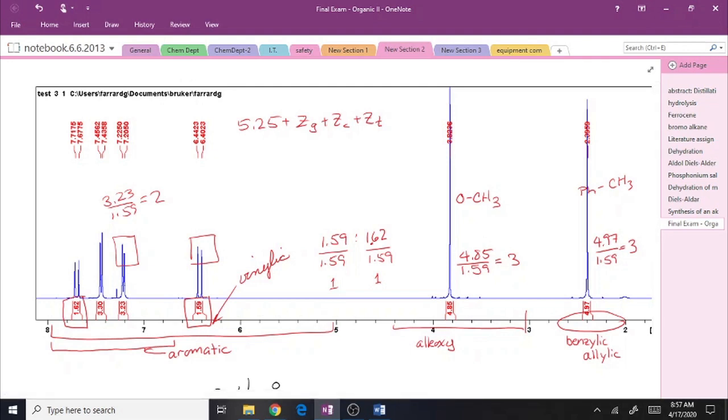You should be able to do this kind of analysis. Of course, given the calculated chemical shift, you would be able to tell that this is one of the vinylic hydrogens and this is the other. In fact, if your structure is one of a double bond where each carbon of the double bond has a single hydrogen, given that these integrations are each one hydrogen, you should be able to recognize then that these are the vinylic ones. But you should also be able to calculate J. I mentioned this when we were talking about calculations. J is equal to the difference in the shifts of the two peaks within the multiplet.